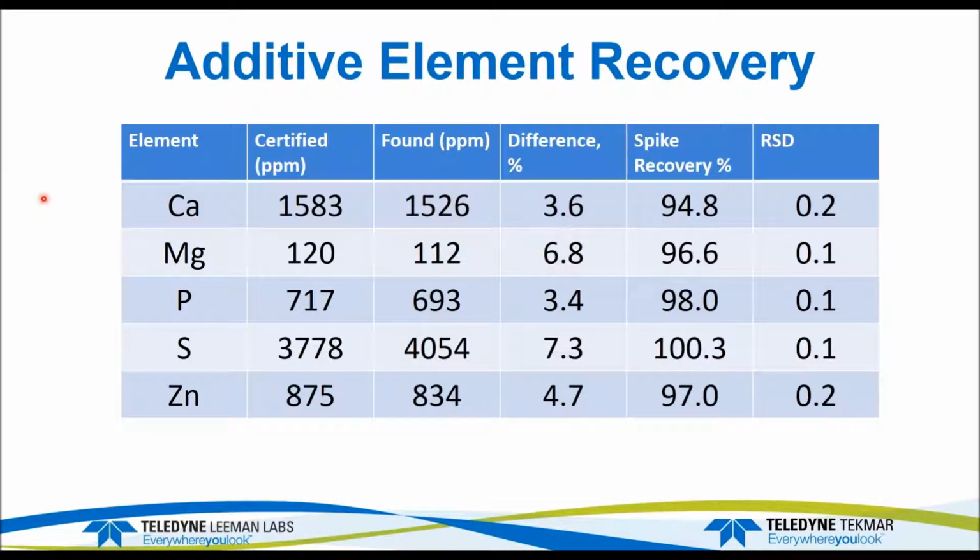So these samples were certified. Here were the certified values, and here are the found results, and these are all within the range of acceptable values for the certified standard. You see again the spike recovery was quite good, and the RSDs are really quite good also.